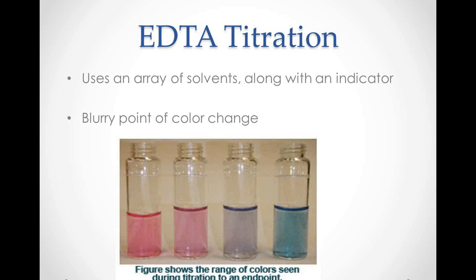The 20 minutes this test takes is quick enough to make efficient in-process changes to the product, but as I said earlier, the results, which then must be back calculated after the test is complete, are not nearly reliable enough to get close to the 1% mark we are shooting for.